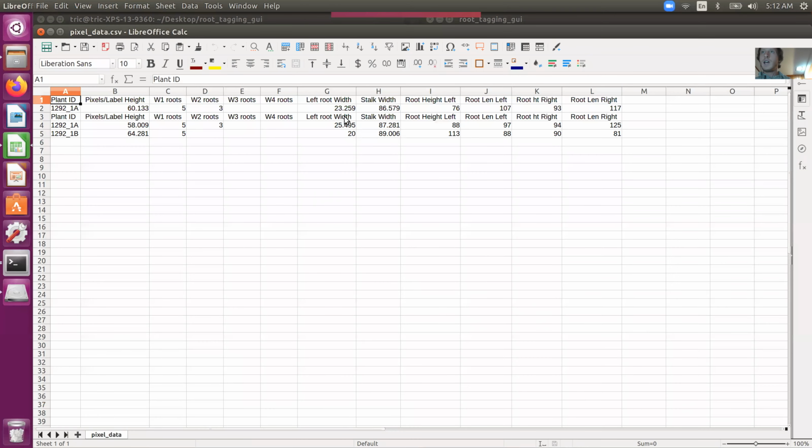All right, so we tagged the same plant. Ideally, these would all be exactly the same numbers, but you can see there are some variations, and probably there would be variations even if you went out there with the tape measure. But I'd say it does help if you're using a mouse for this because it's a lot easier to click around.